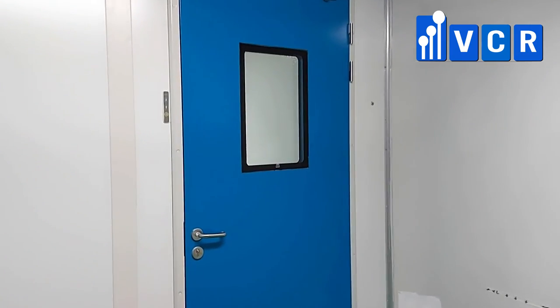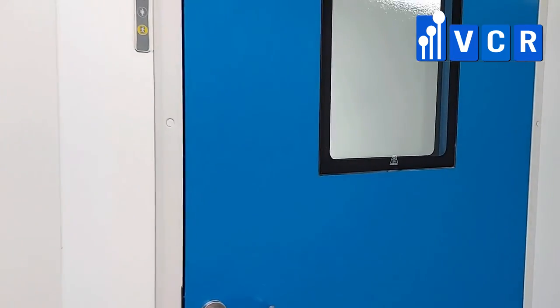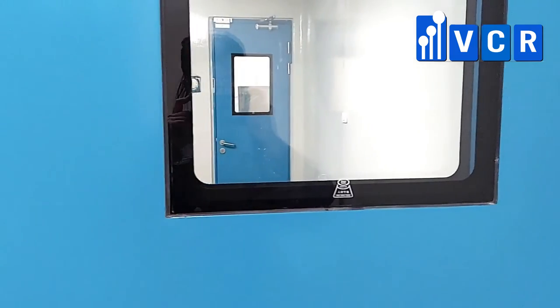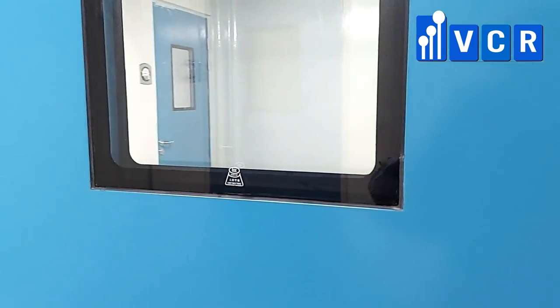The glazing in the steel door is made of two layers of glass. It is double-glazed, and argon is injected between the glass layers to provide additional insulation.